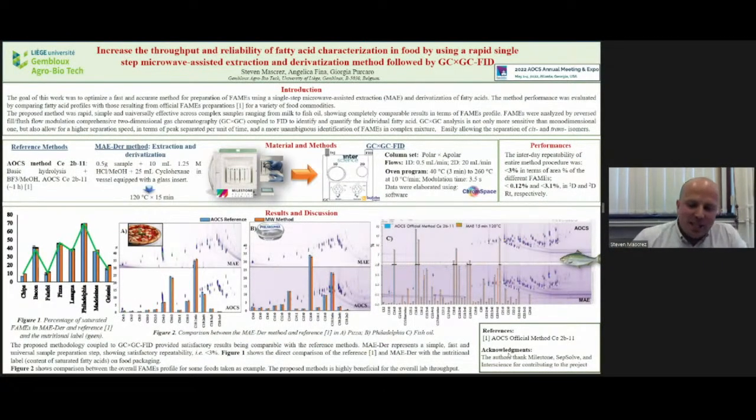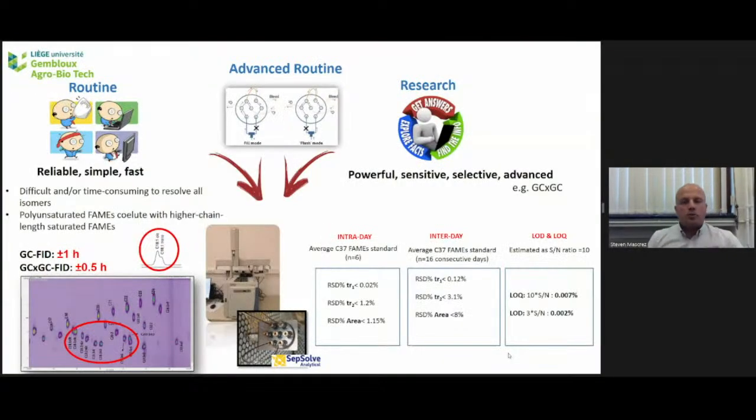Thanks, Nuli, for this kind introduction, and also for letting me show another part of my work, of our work. So here I'm going to show you a method that we developed for the FAMEs analysis. First, why we decided to develop and optimize this method: it can be a long method in terms of GC analysis, but also preparation. So here the goal was to have a simple, fast method usable in routine, but with higher sensitivity or selectivity.